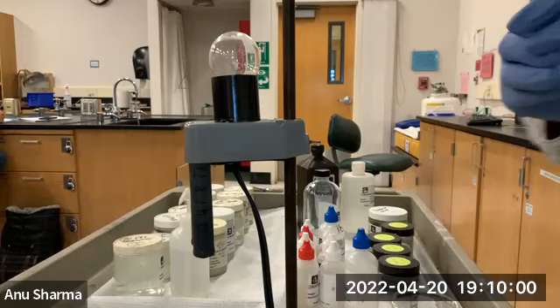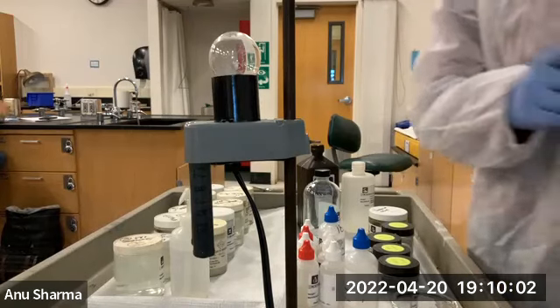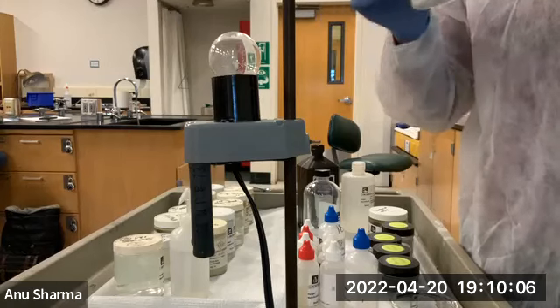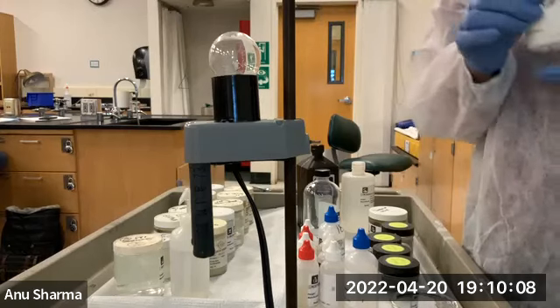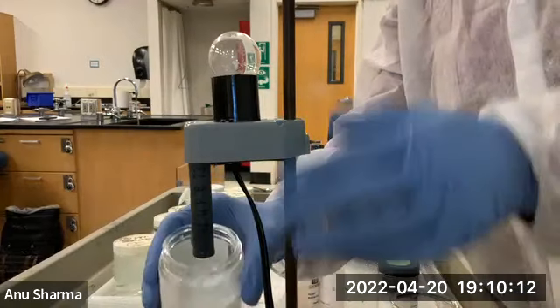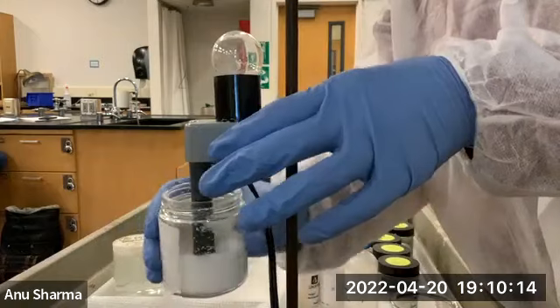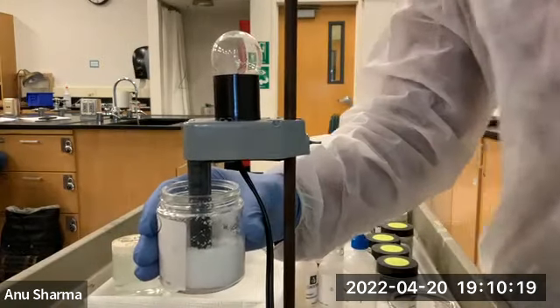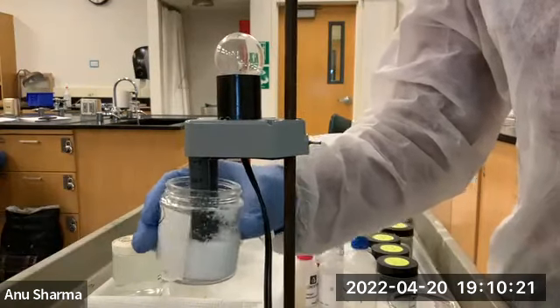Now NaCl as a solid. If you have something as a solid, do you think it will ionize in a solid form? And will it conduct electricity? No. So in a solid form, sodium chloride, I'm really touching the electrodes here, okay?